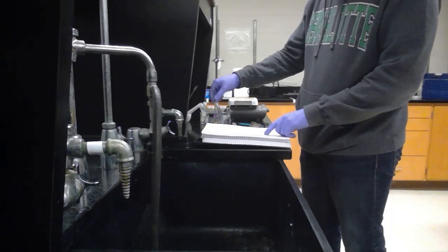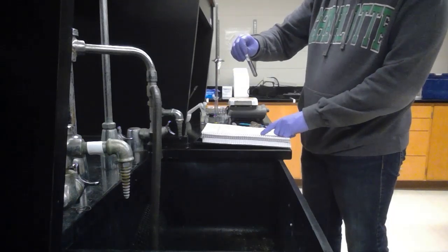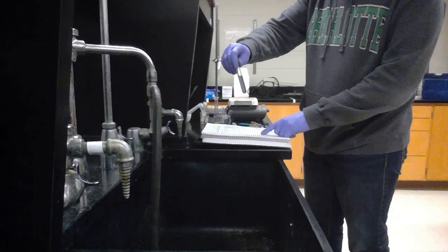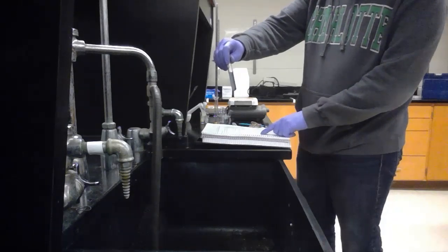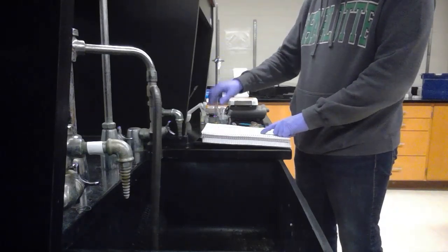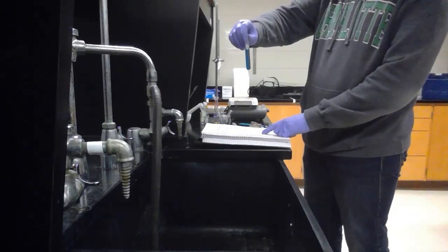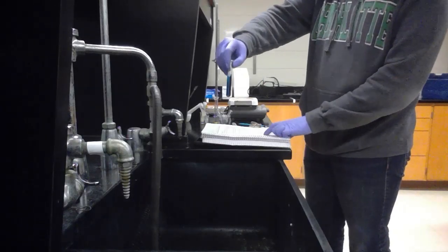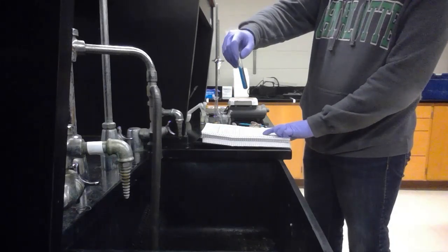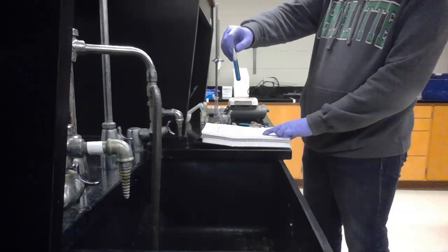And then for our lysozyme control, that's this one here. It's kind of a light blue color, and the absorbance is 1.480. And then the last one is this reagent blank, which is just water and the Bradford reagent. And that has, it's a dark blue color, and its absorbance is 1.440.